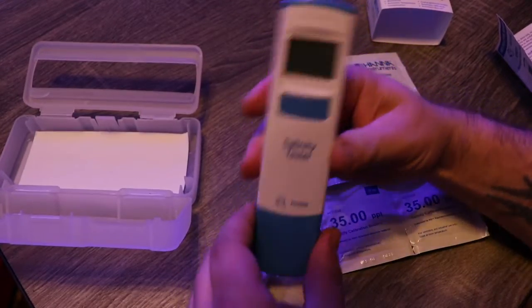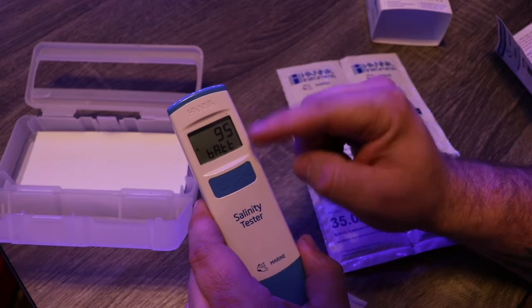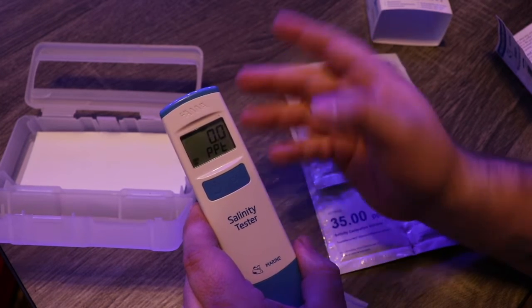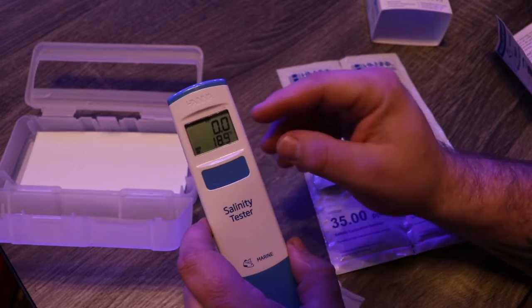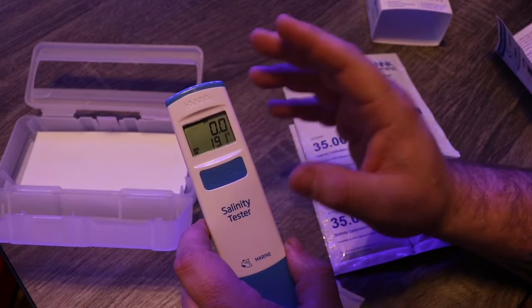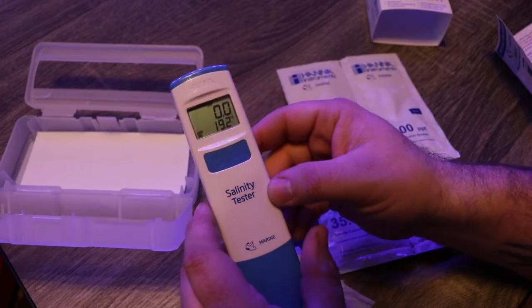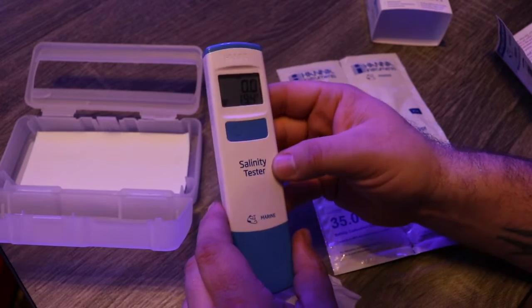Now we're going to turn it on. When you first turn it on, it gives you a reading of the battery — it's showing 95% life remaining — and it's going to remain at the last settings you picked for your Salinity Tester. We'll get into how to change those settings in a minute.